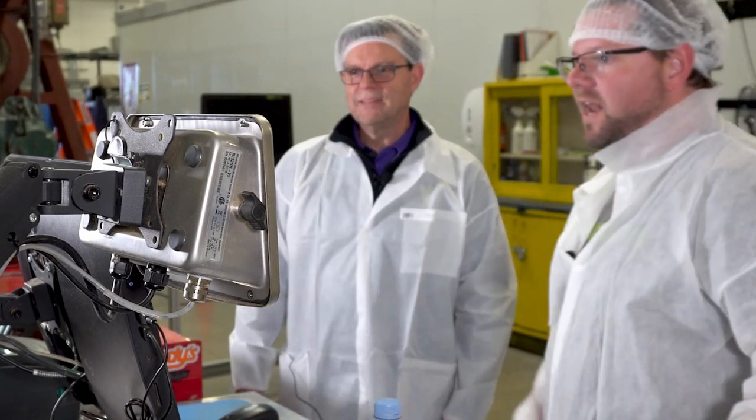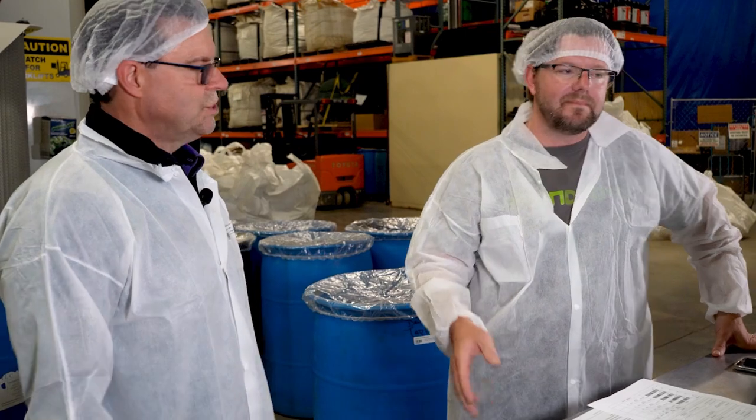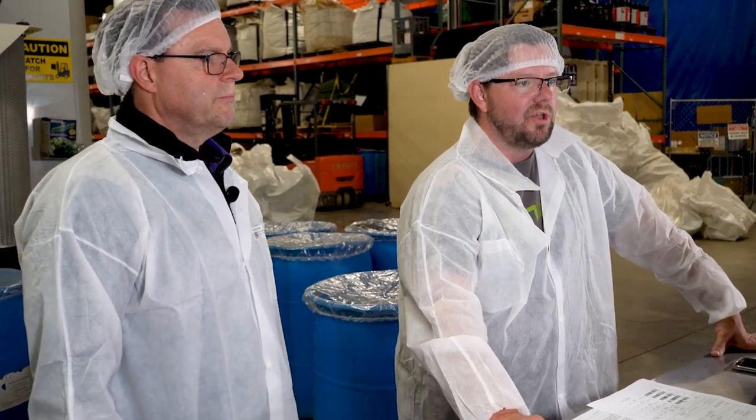And what's really cool about this is, maybe at the facility here, we do hundreds of samples. Those will all be sitting here. You can go back and look at them. They'll disappear from this list when the analytical is done on them. So let me show you what that looks like.